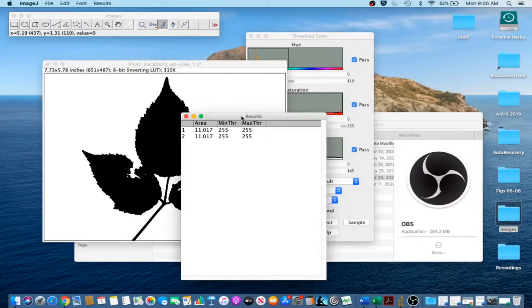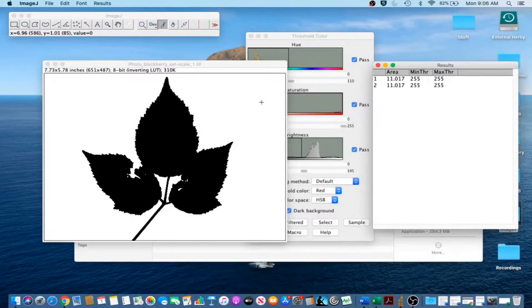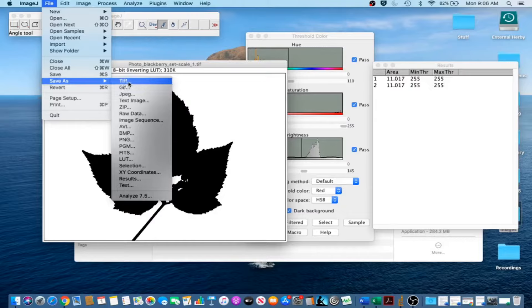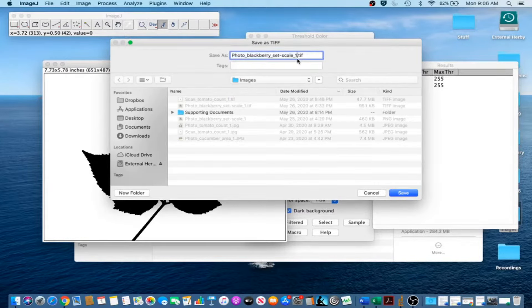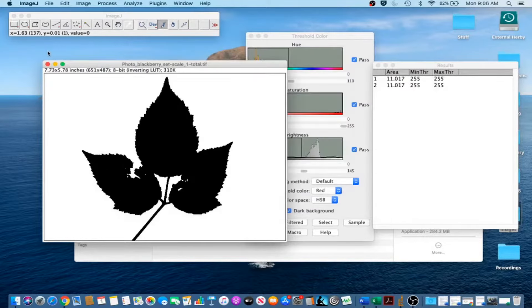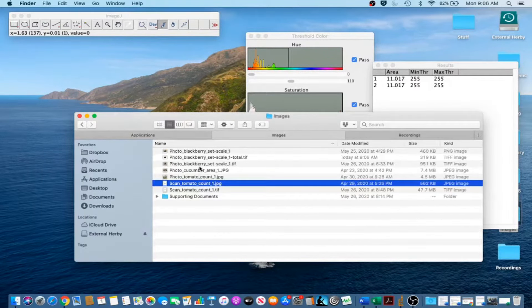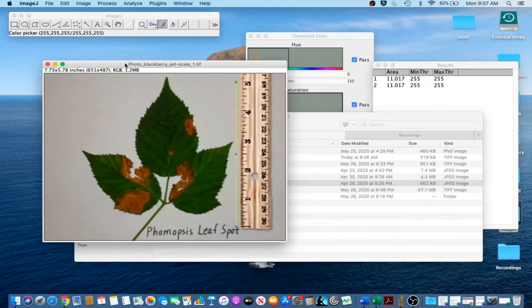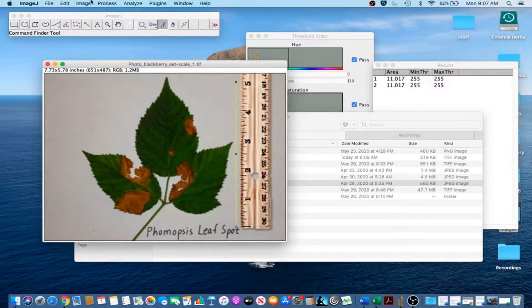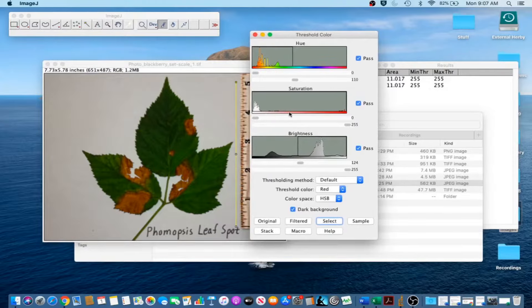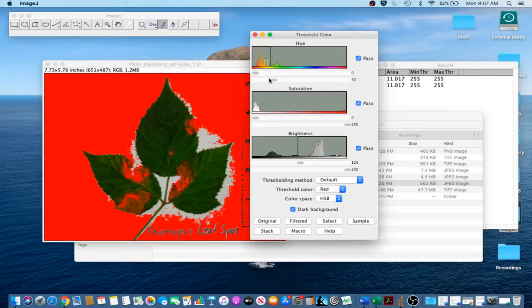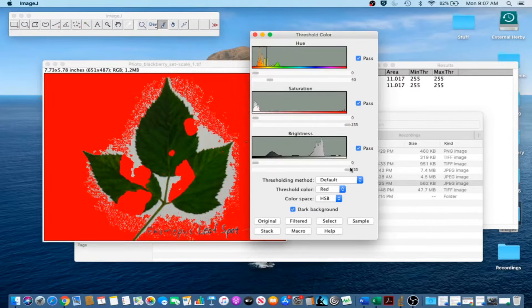Minimize the results window and keep it open. If you want to save the processed image, save it with a unique name. Then close that image and open up the same image again. This time we're going to capture the area of the diseased leaf area. Go to Image, Adjust, Color Threshold again. A hue range from 0 to 40 works well in this case. Play with the saturation and brightness until satisfied, then click Select.